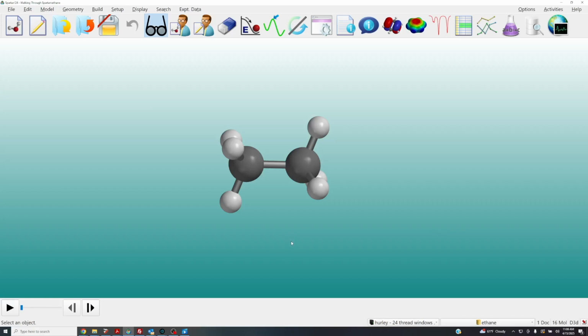Okay, so firstly, let's talk about how we make things bigger or smaller. So, zooming in or out.